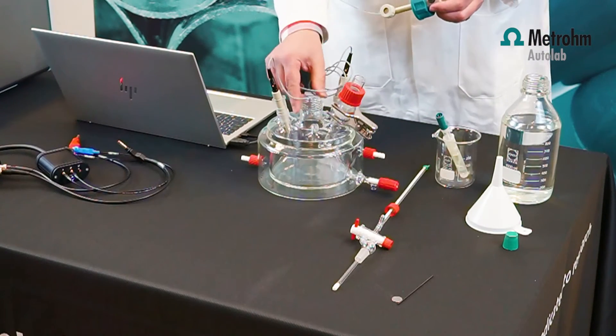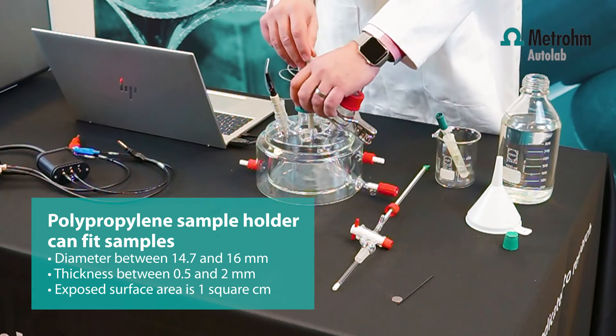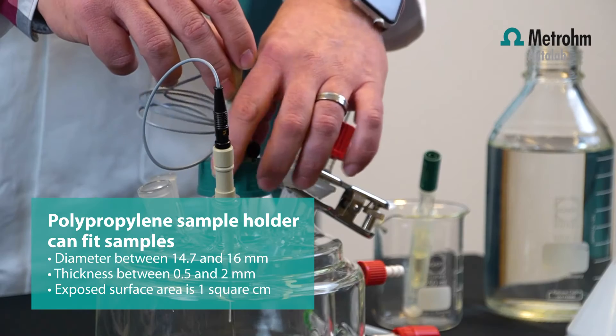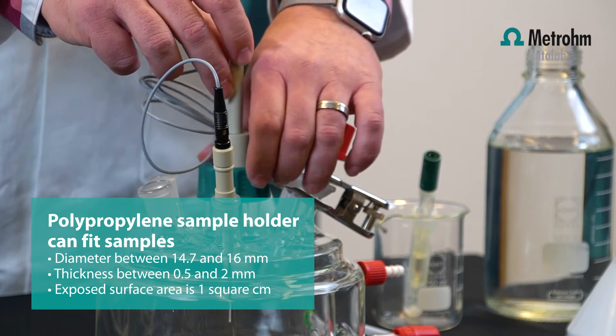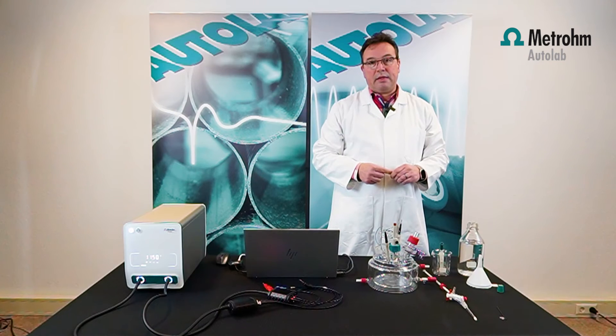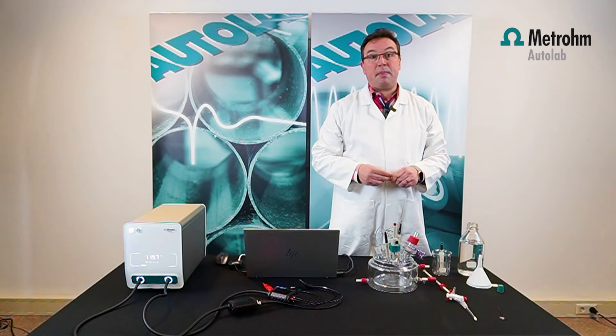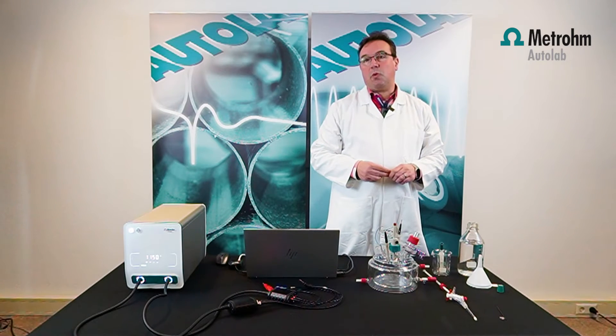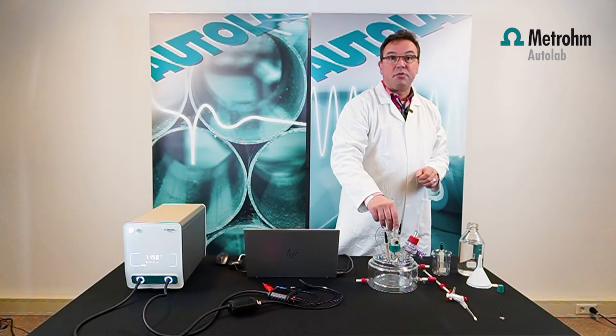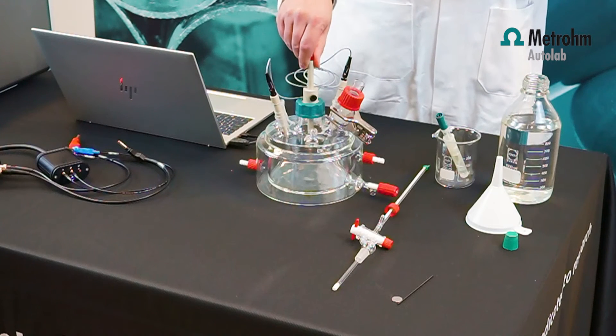Back to the corrosion cell. Here's my corrosion cell. It's a polypropylene sample holder that can fit samples between 14.7 and 16 millimeter in diameter and a thickness between 0.5 and 2 millimeter. The exposed surface area is going to be one square centimeter. This is a lightweight, low friction and wear resistant material with good physical and processing properties, capable of operating temperatures more than 90 degrees Celsius.